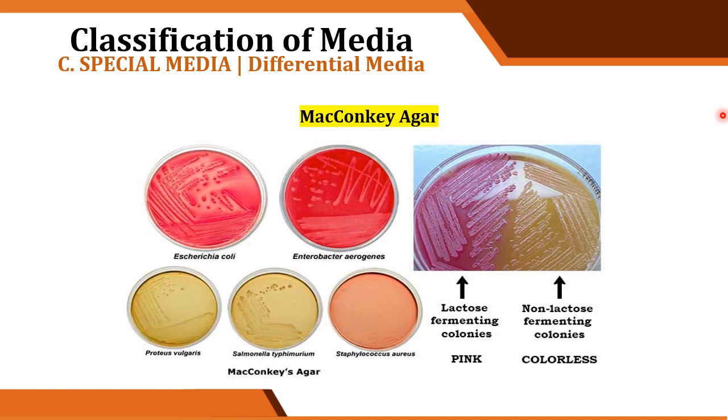Okay? And also, it contains bile salts. Okay? So, bile salts causes the medium to be acidic. Diba, normally, ang ating most bacteria, they survive in a medium na neutral si pH, around 7. Diba? So, kapag acidic, certain bacteria lang yung kayang tumubo sa kanya. Okay?